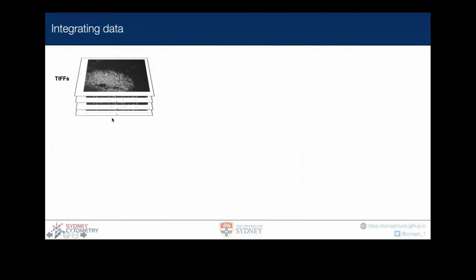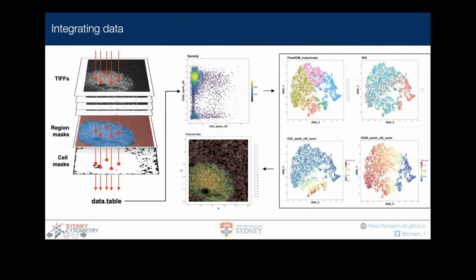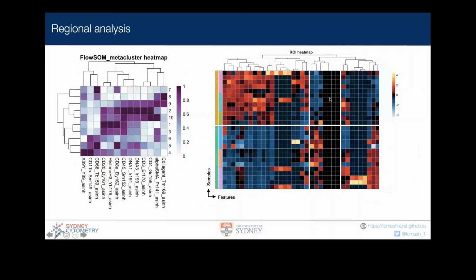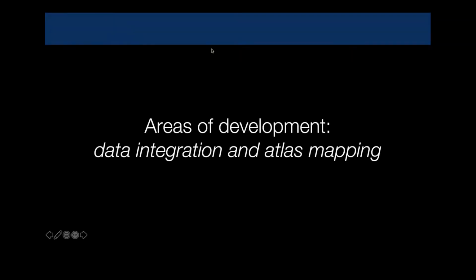What we can then do once we have all this information is we can take our individual channel data from these images, our region masks or our cell type masks, as well as our actual cell boundary masks. We can integrate all that data together and go through our normal analytical process, so to speak, generating our clusters on our cell types. And once we have that output at the end, we can start asking some spatial questions, looking at how we can identify how different cell types relate to each other in a spatial context. And does that change, say, between a healthy sample and a sample from a disease patient, which is really quite fun.